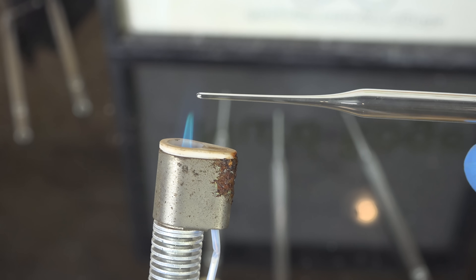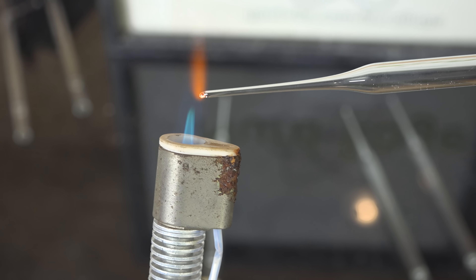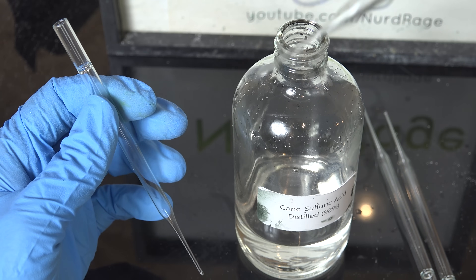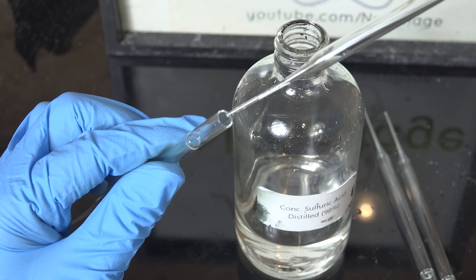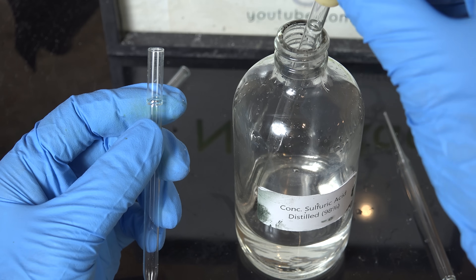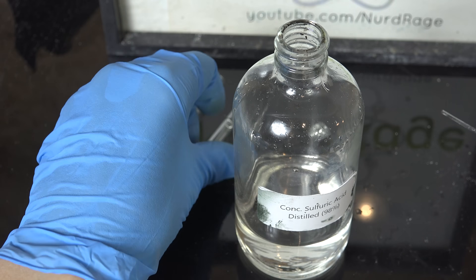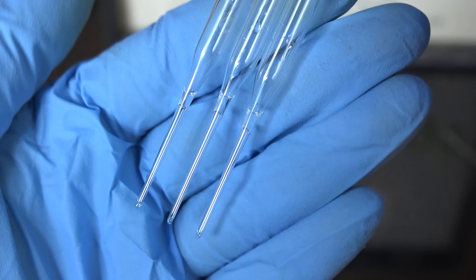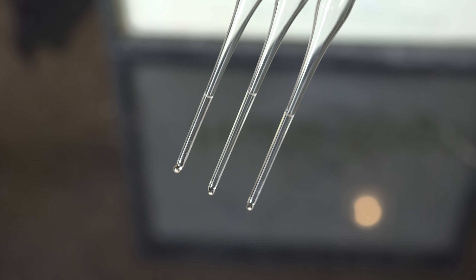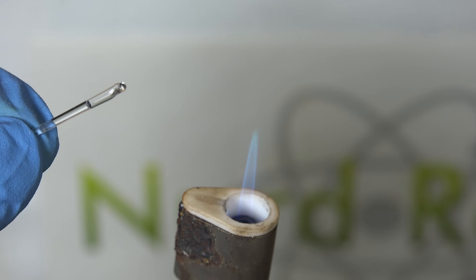Now to make the capsules of sulfuric acid. First we get some Pasteur pipettes and flame seal the tips with a torch. Once we have several, it's time to fill them with acid. To each pipette we add a couple of drops of concentrated sulfuric acid. A rough way of gauging it is to fill the pipette with about 2cm of acid. Do not add too much acid or we won't be able to seal the capsules later. Shake down any bubbles in the bottom, and there we go — tiny closed pipette tips with acid in them.